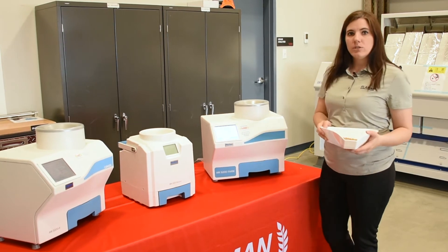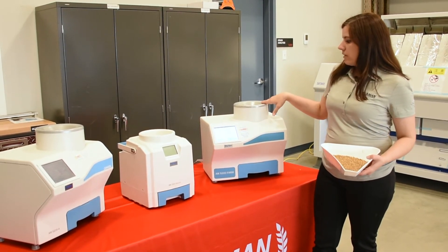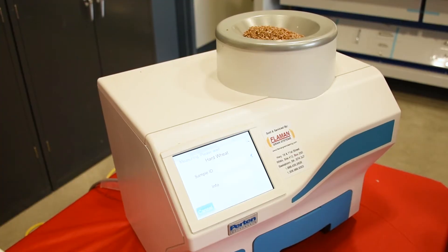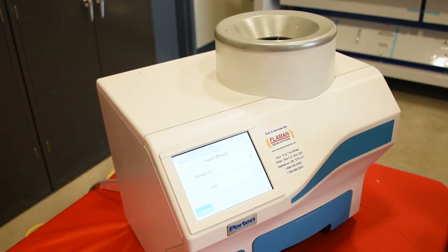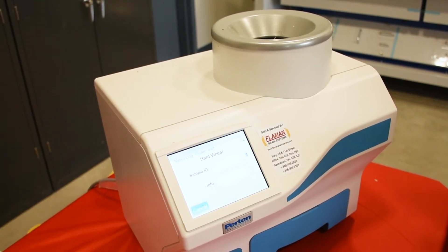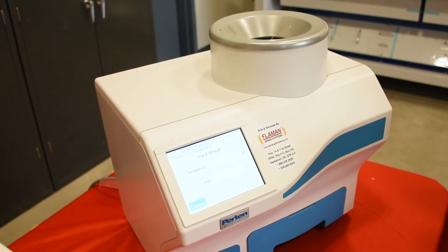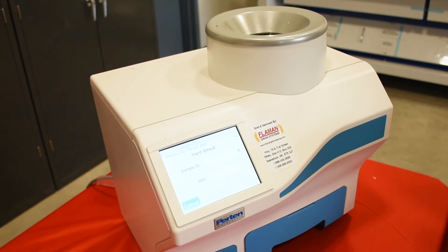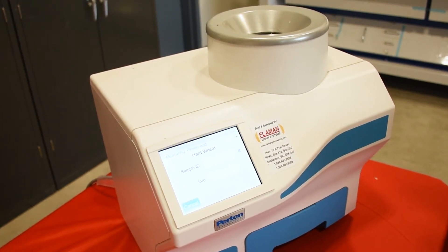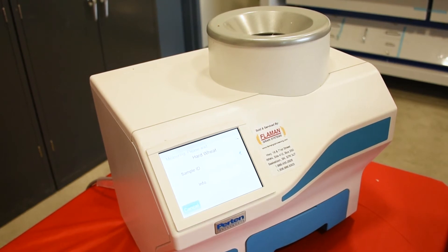There's no need to weigh out the sample. Once it's filled up the cone, you hit go and the machine will test. The meter has a large cell to have a big representation of the grain, and the meter does all of the measuring and all of the filling of the cell by itself. It also displays moisture, bushel weight, and temperature.